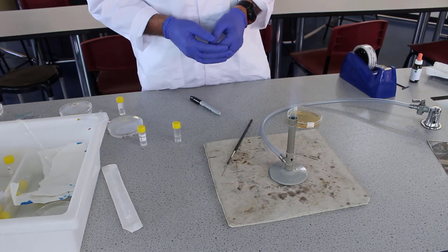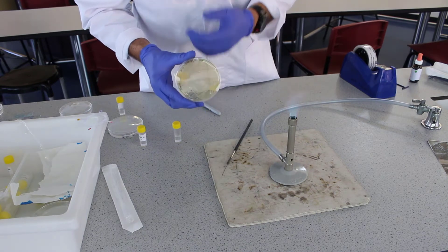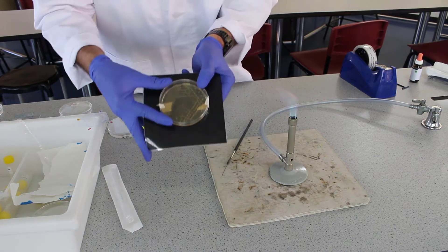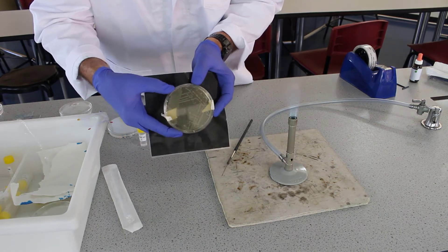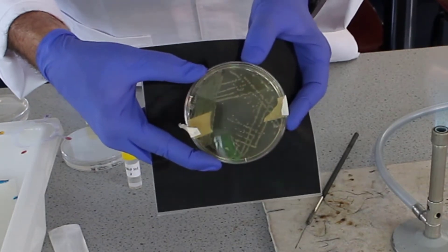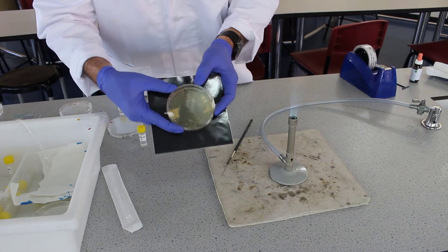In this video I'm going to show you how to do a 16-streak dilution. A 16-streak dilution is what we use to isolate single colonies of bacteria. Here's an example of a 16-streak dilution, and you can see those single colonies that we can then use to make subcultures and do various experiments. So we're going to have a go at doing that now.